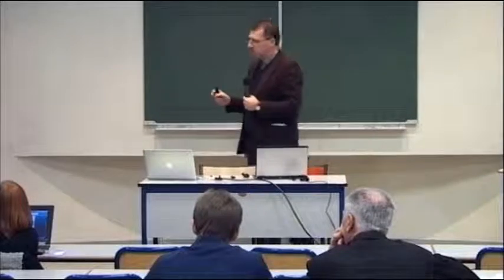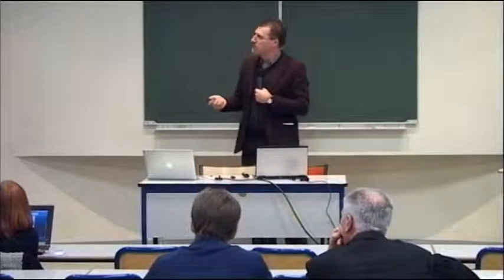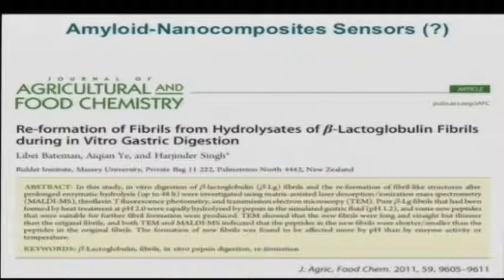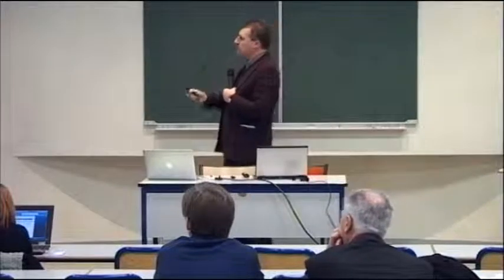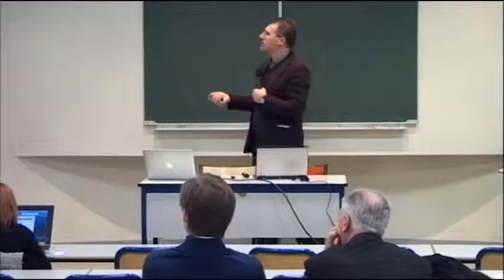I want to bring up with you two applications. The first one was inspired by a work by my good friend Harjinder Singh in New Zealand, which was looking at these fibers, again from beta-lactoglobulin, and how these are digested in the stomach, okay? The way they did that is they did in vitro digestion with pepsin, with a gastric fluid, and saw how the contour length changes with time. They have to do a lot of TEM, looking at the contour length evolution with time at this pH. But this proves in the end that these fibers are digested. And we wanted to do something in one shot to measure the effect of digestion on the system. So we used the fiber to design a very simple biosensor.